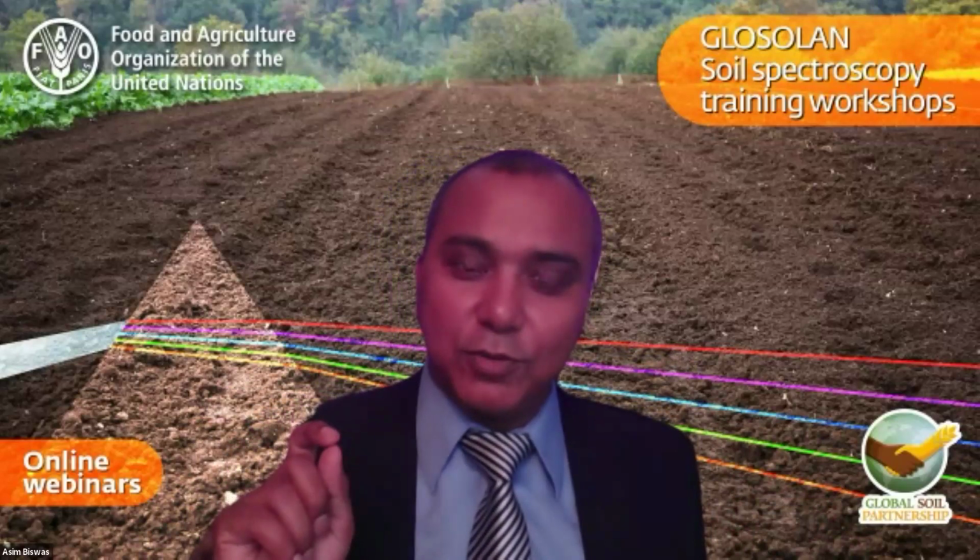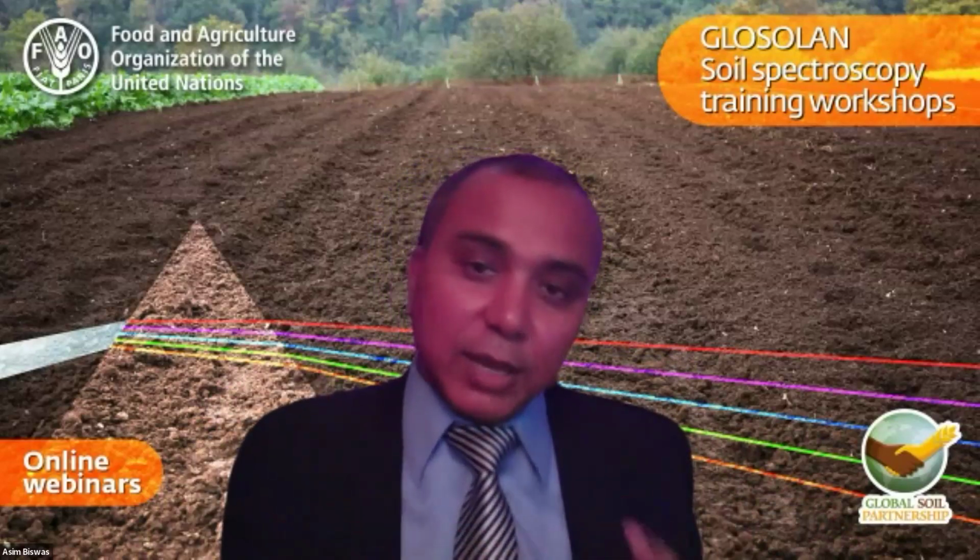So that means as we go through some of the nutrients, those are limited in terms of how much, what is their bond energy, and the light source we are providing may not have a direct implication or direct connection. Due to those differences, some of those properties are not easy to measure directly. So again, one way I can say, oh, I have spectral data. I can actually calibrate the spectra with any number using a mathematical algorithm and say, oh, this is the prediction of this. It's possible, but truly think about the physical meaning of it.